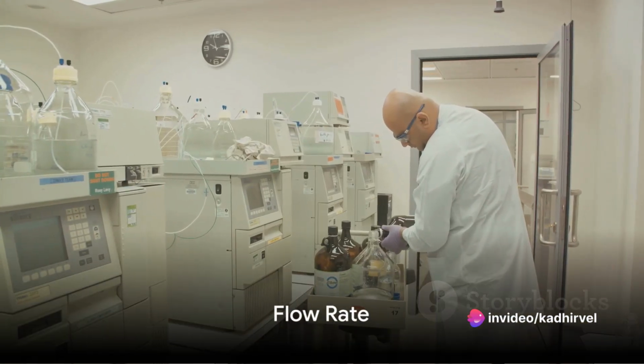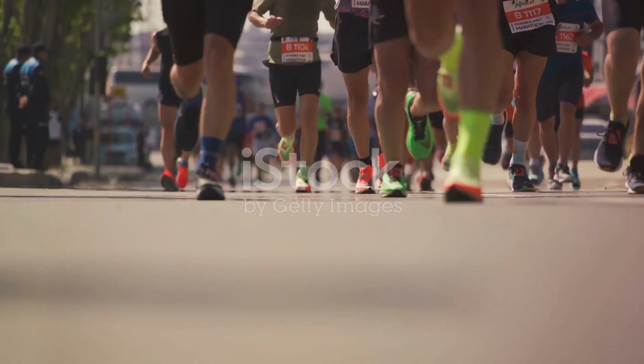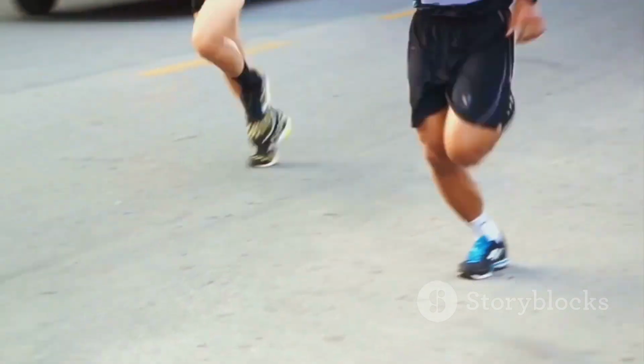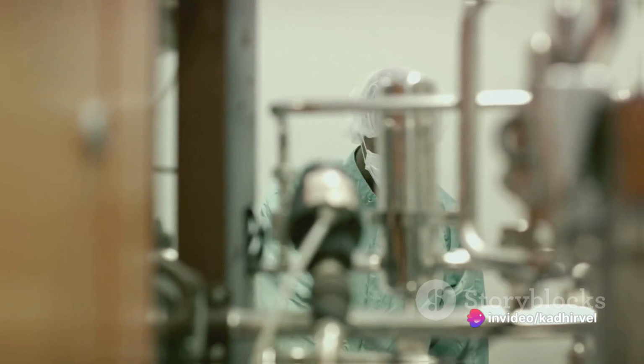When we talk about flow rate, we're referring to how quickly the mobile phase moves through the chromatography column. It's like the pace of a marathon runner. Too fast, and you risk poor resolution and reduced binding. Too slow, and you're looking at longer processing times and increased costs.